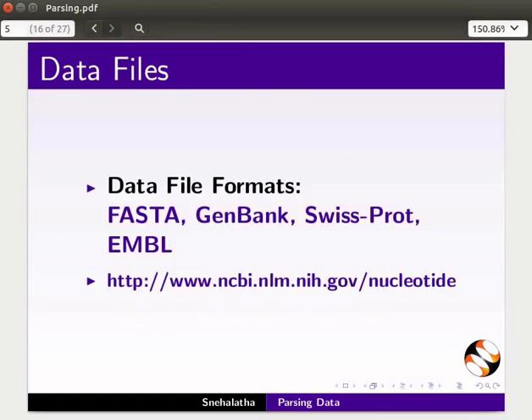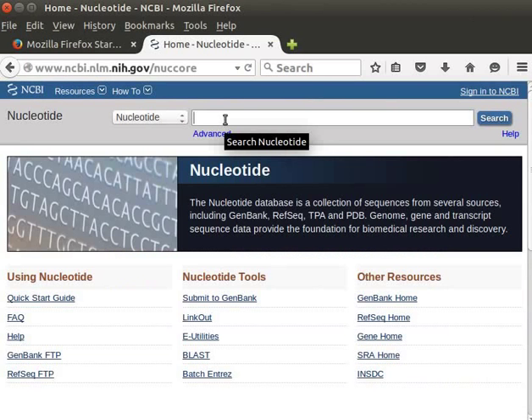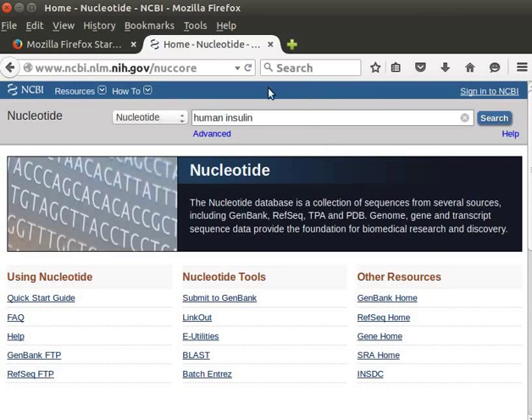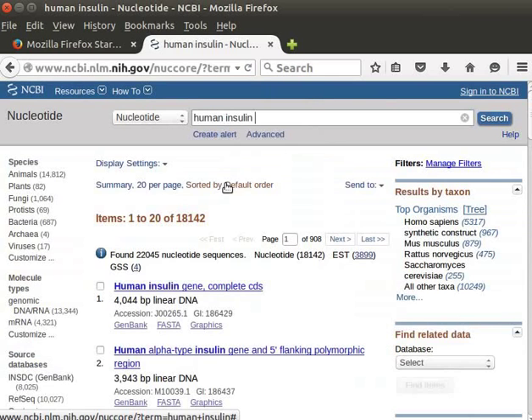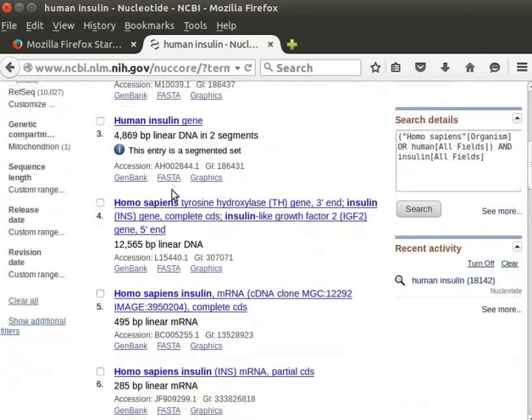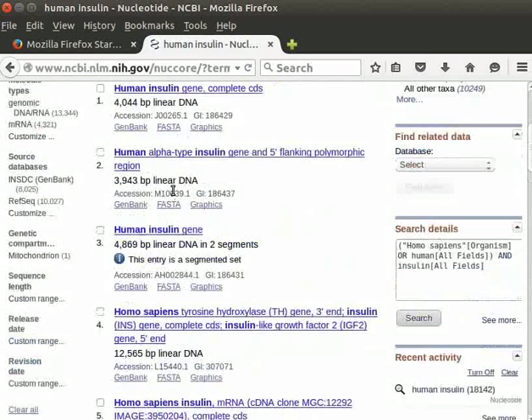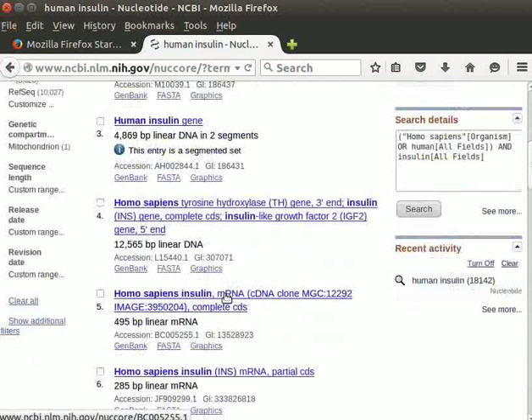Open the website link given below in any web browser. A web page opens. Let us download FASTA and GenBank files for the human insulin gene. In the search box, type 'human insulin' and click on the search button. The web page shows many files for the human insulin gene. For demonstration, I will select 4 files with the name 'Homo sapiens insulin mRNA' that have less than 500 base pairs.